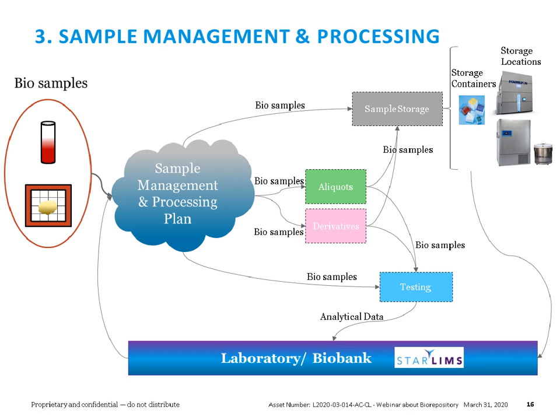And also the derivatives, similar to the aliquots, we will need to indicate what is the outcome material, the outcome sample type that we're going to capture here, whether it's going to be perhaps a DNA or RNA. So those are like the typical examples for derivatives. Like you can have the nucleic acid extractions, but also you could have, in the case of the tissues, perhaps as a result slides for preparation.